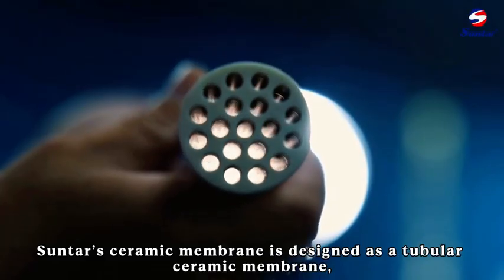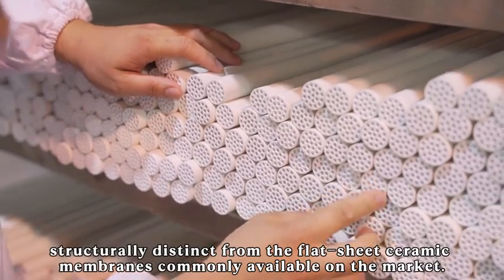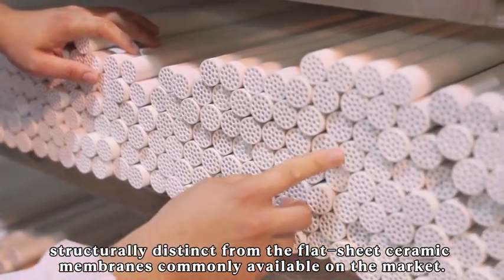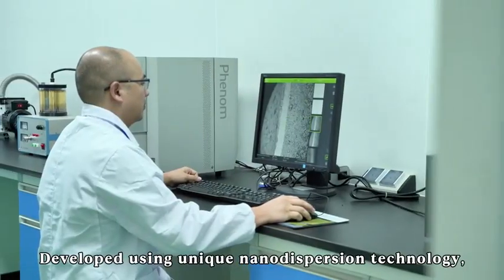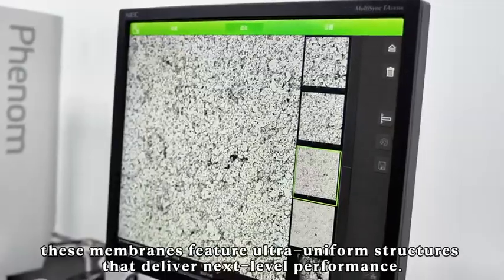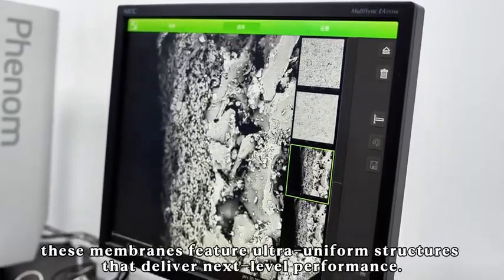Sunter's ceramic membrane is designed as a tubular ceramic membrane, structurally distinct from the flat sheet ceramic membranes commonly available on the market. Developed using unique nano dispersion technology, these membranes feature ultra uniform structures that deliver next level performance.